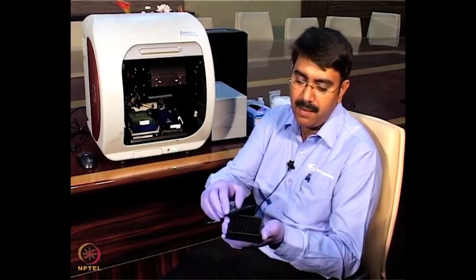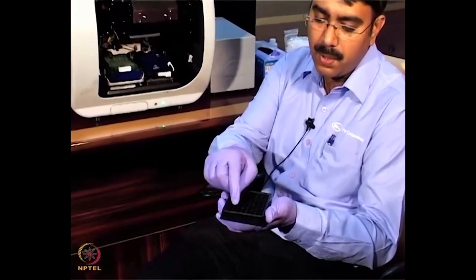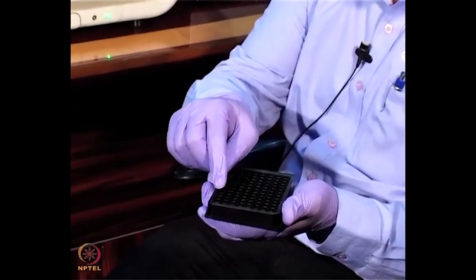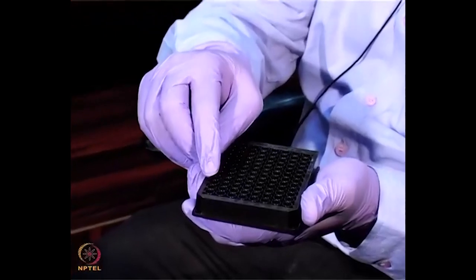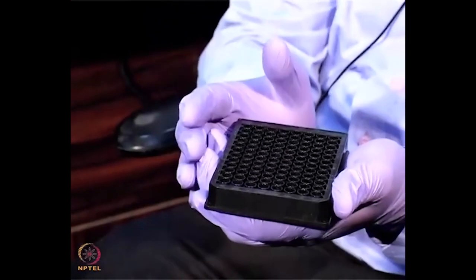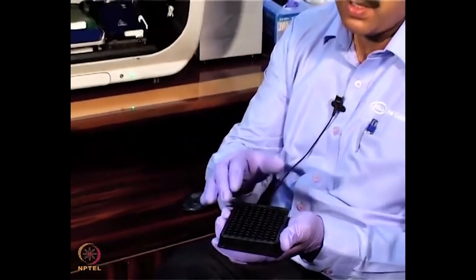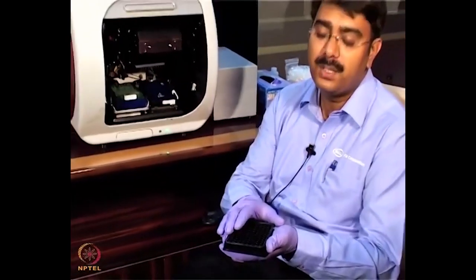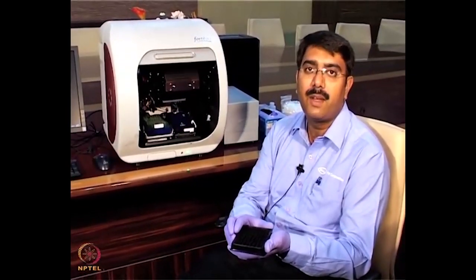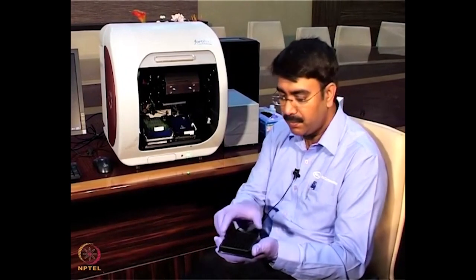This is the plate map here. This is the buffer, the first column, and in the second column I am going to put the 10 micrograms per ml concentration of biotinylated protein A, and in the third column I am going to put buffer. It will be useful so that unbound biotinylated protein A gets washed off here, and this well I am also going to use for the dissociation purpose. And in the last wells I am going to put the analyte, that is 25 micrograms per ml, serially diluted across all these 6 wells.